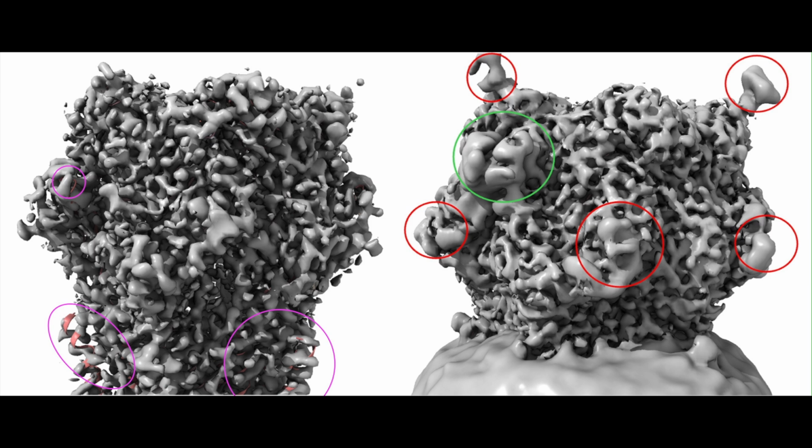So what I'm circling here, you can see in these red circles, these all correspond to sugars that interact with the receptor, as I mentioned before, but they have their own EM density map associated with them because they can also scatter electrons.